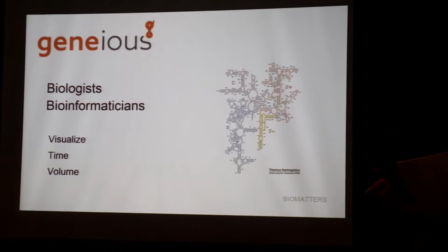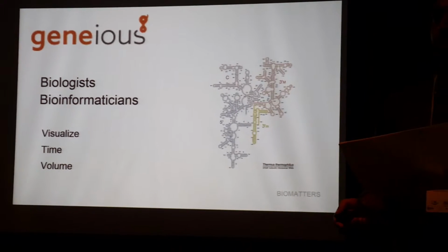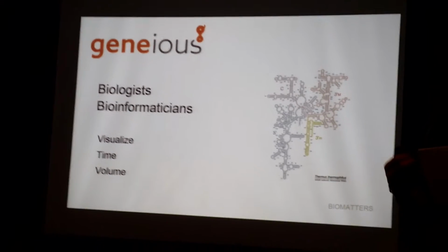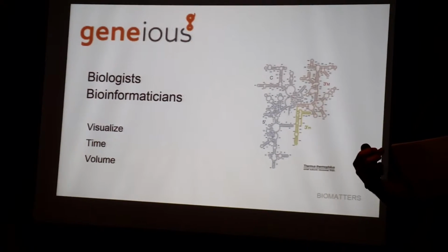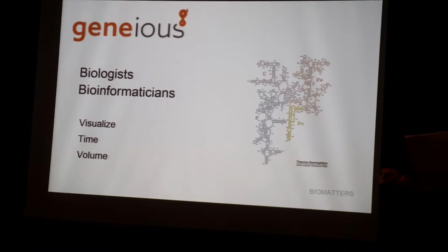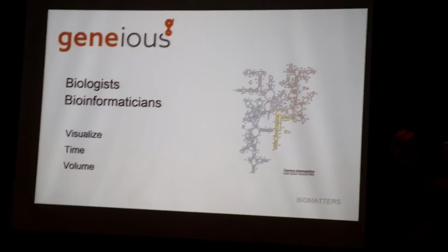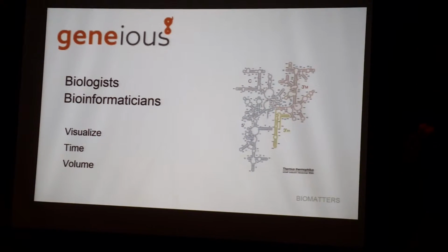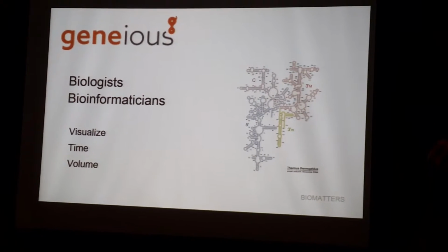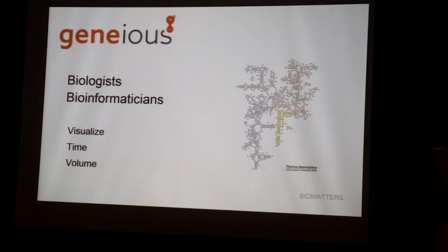The second is that bioinformaticians are dealing with a lot of volume, right? They are typically very understaffed. I'm not sure how it is in your country or your location, but in the States, there are very few bioinformaticians and a lot more biologists. And so it becomes difficult for the bioinformaticians to deal with the masses of data, and to add to that is this issue of the contextual information, right? So we've taken an approach of letting the biologist do a lot of the interpretation and analysis themselves, or at least the first pass of that. And that way the bioinformaticians can focus on areas that are more difficult, the harder problems, the things that actually require algorithmic development and a little more of their proper skill set.